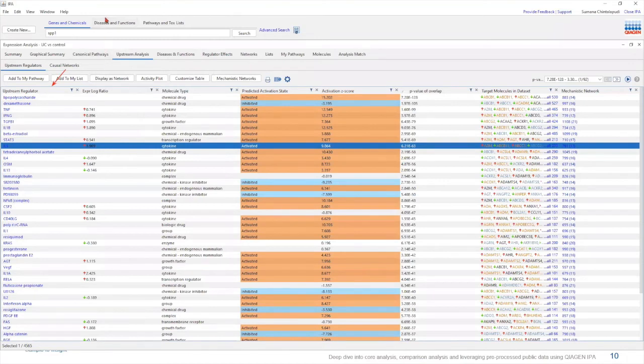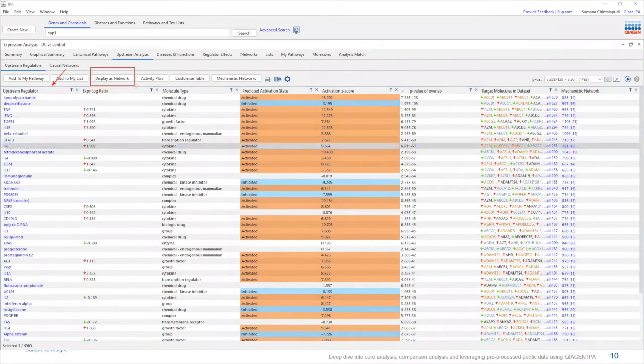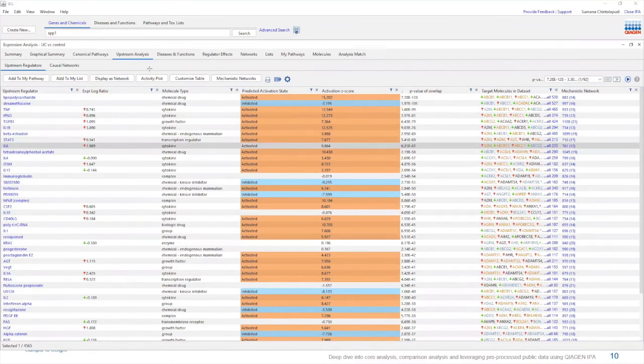Now to view any regulatory network, you simply have to click on one of the rows for a regulator and click on this button for display as network. But before we do that, let's find out what sort of information this table can provide you.